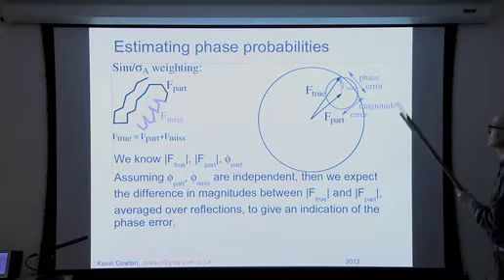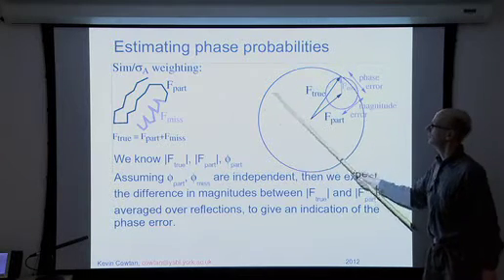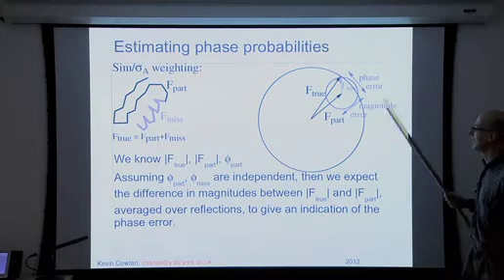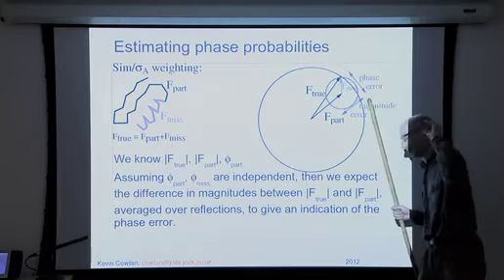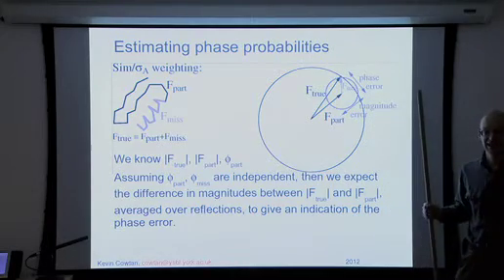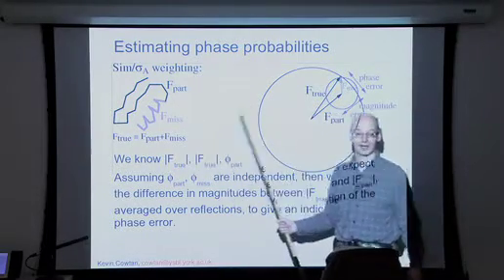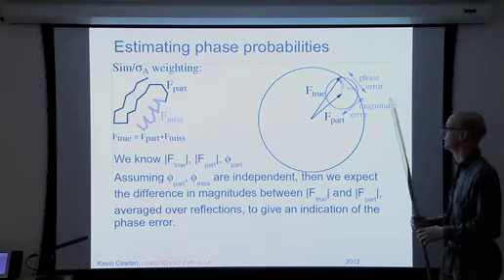The basic concept is that we've got our known structure factor amplitude, and we've got a structure factor amplitude and phase which contain errors, which come from our modified map. Conceptually, they could come from an incomplete model, but in practice, in our case, they're coming from a map with noise.